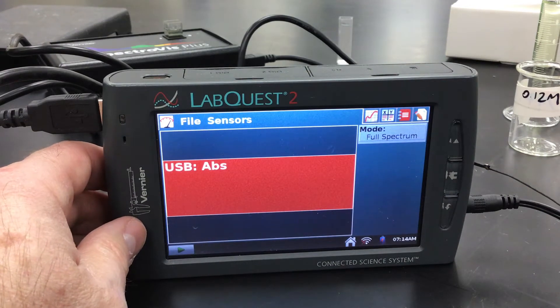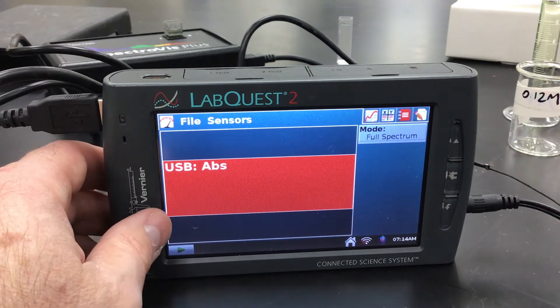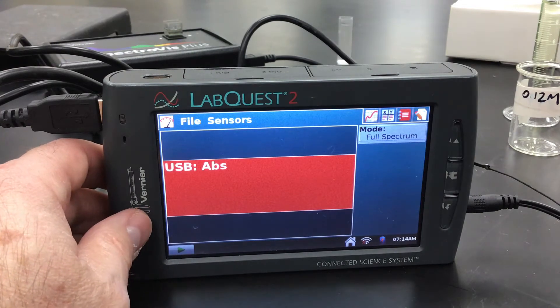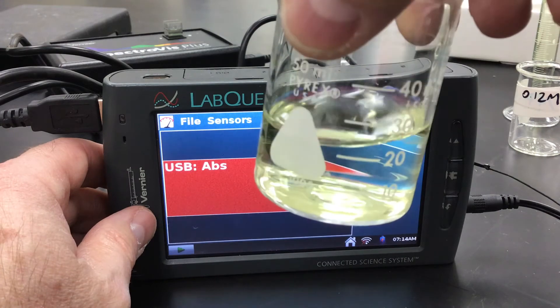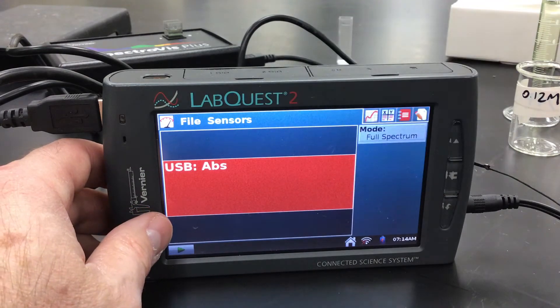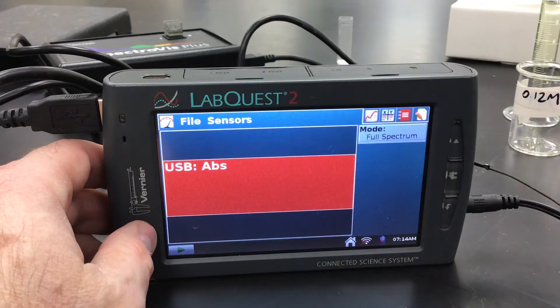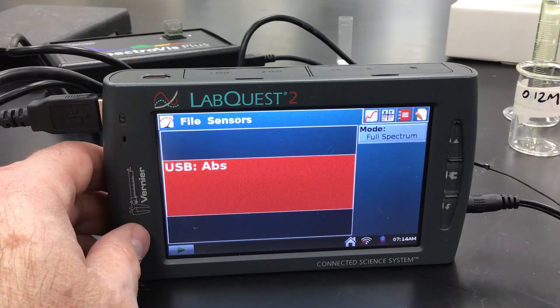Hey everybody, it's Mr. Mott. What we're going to do is go through experiment 25, which is finding the rate and order of a chemical reaction. We're going to be mixing some iron 3 chloride solution, slightly acidified, with a potassium iodide solution. When we do that, it's going to get dark because you're going to be producing some iodine in solution.